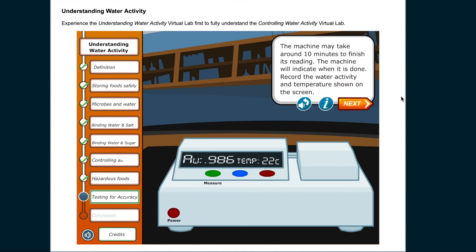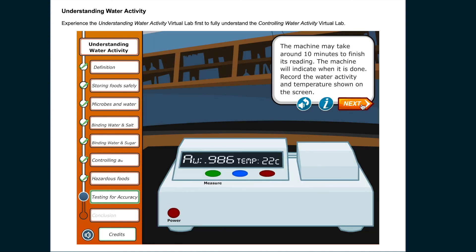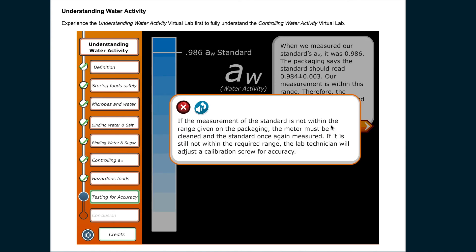The machine may take around 10 minutes to finish. Record the water activity and temperature shown on the screen, following the lab's protocol for recording all calibrations. When we measured our standard's water activity, it read 0.986 — the packaging says it should read 0.984 ± 0.003, so our measurement is within range and the instrument is accurate. If the measurement is not within range, the meter must be cleaned and re-measured; if still out of range, a lab technician will adjust the calibration screw.